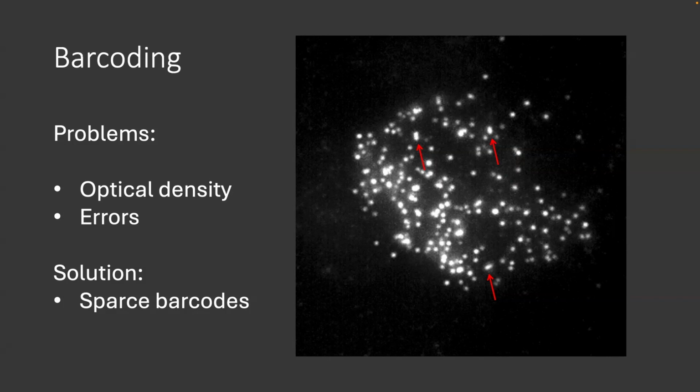Like this is a big dot. It might be 1 molecule, it might be 2 molecules, might be 3. I don't know. And if you do more and more genes at the same time, you will run into these problems more and more. The second thing is that when you do many rounds of labeling and stripping, there's a lot of fluidics going on. There's movement of the sample, and you will accumulate errors over time. So that is a way that you would lose signal.